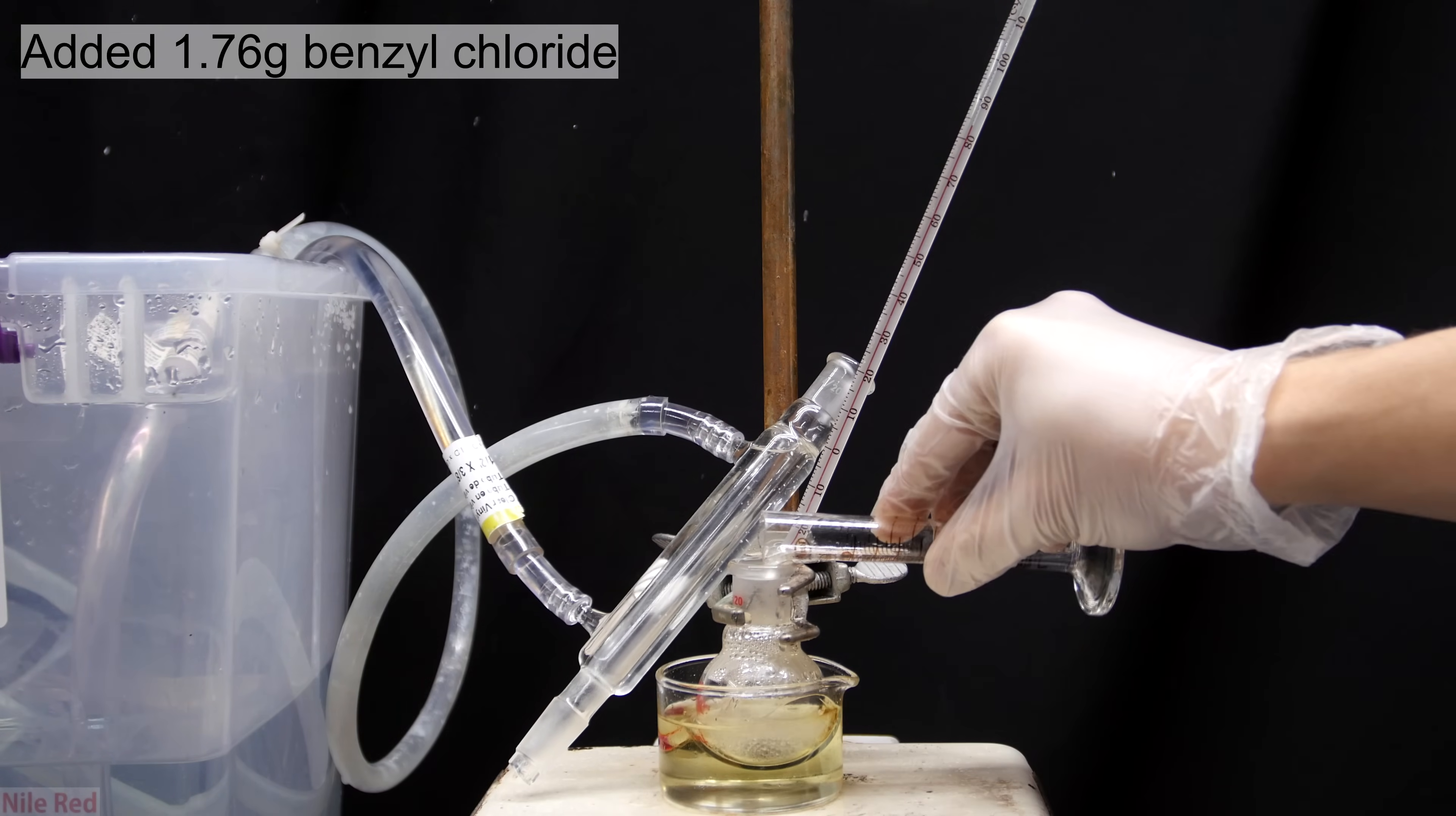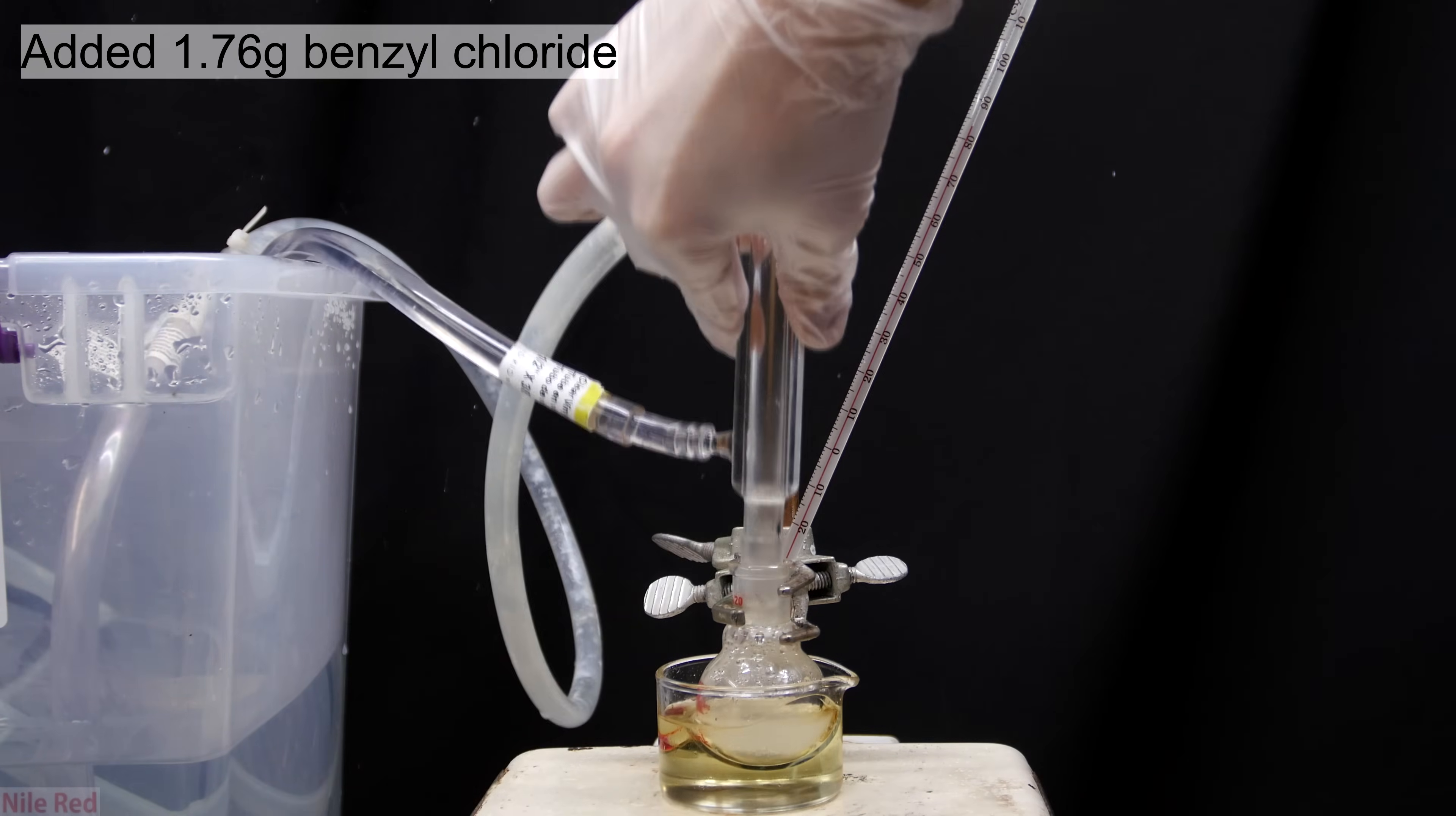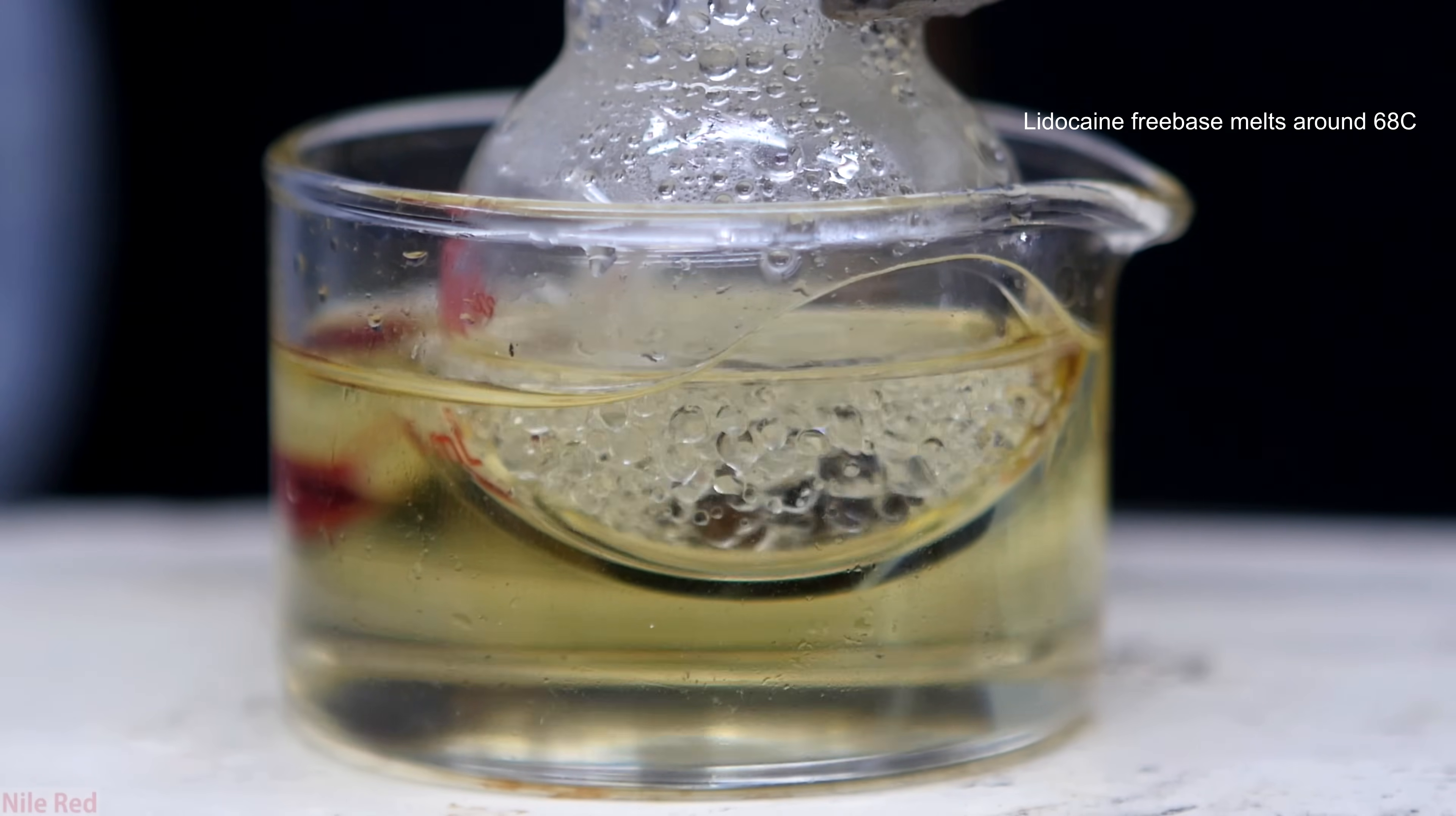Once we're around 80°C, the condenser is taken off and I add 1.76 grams of benzyl chloride. Once the benzyl chloride has been added, the condenser column is replaced back on top of the flask. If we take a closer look at the reaction, it actually kind of looks pretty cool. These little small globs of liquid are actually melted lidocaine. As the lidocaine reacts with the benzyl chloride, the globs should slowly disappear.